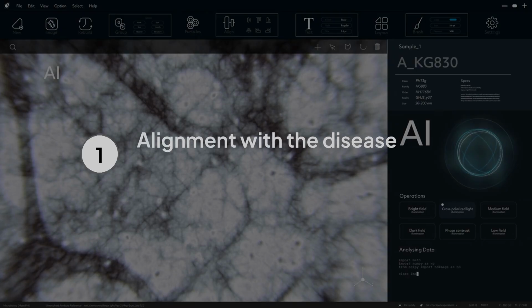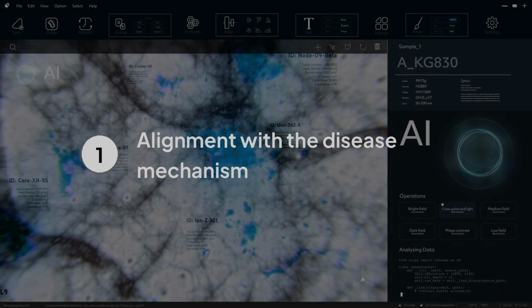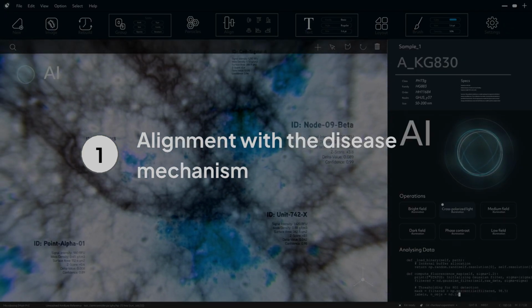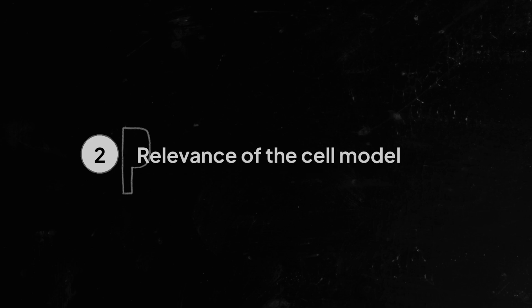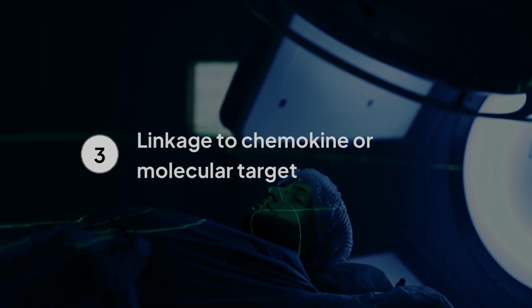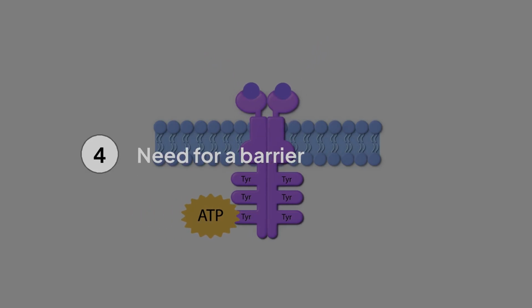Across all three settings, application fit depends on 5 considerations: alignment with the disease mechanism, relevance of the cell model, linkage to the chemokine or molecular target, the need for a barrier, and the required throughput. Their priority changes with the question. Barrier relevance may be central to one oncology program and unnecessary in another. Ligand linkage may define an immune recruitment study but be secondary in a general motility screen.